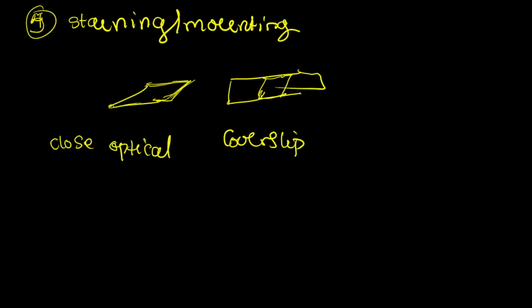So these tissue components have relatively close optical density, and by virtue of having this close optical density, it means that the degree to which they refract light is very similar. Okay, so without staining, this tissue slice would look like a tissue slice. It would not display the components as they are to be viewed. Okay, so we won't be able to examine the tissue components clearly. Now this is where staining comes to play.